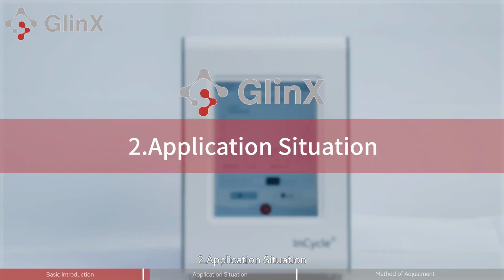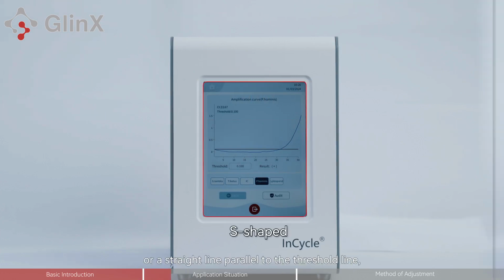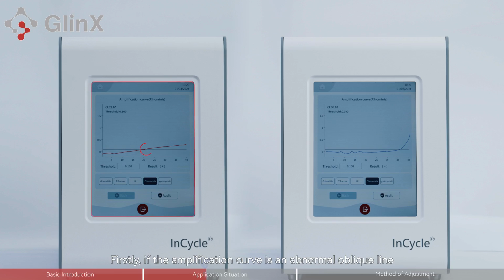2. Application situation. After the detection, if the amplification curve is a typical S-shaped or a straight line parallel to the threshold line, the threshold does not need to be adjusted. The following two cases involve threshold adjustment. Firstly, if the amplification curve is an abnormal oblique line rather than a typical S-shaped or S-like shape, the threshold line must be adjusted upward so that it has no intersection with the amplification curve.